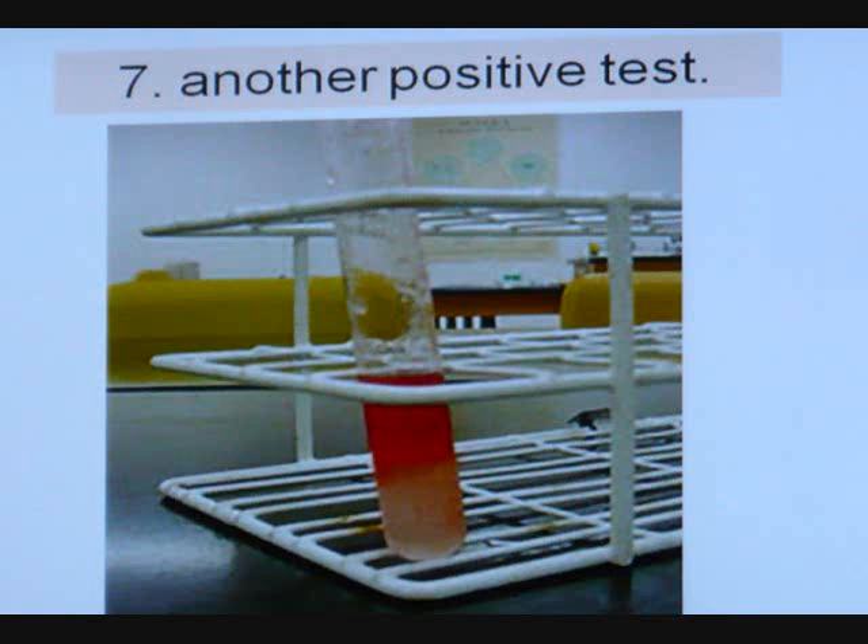I'm going to add the Sudan solution to it. I wonder how much of that will then turn red. I don't expect all of it to — I don't think it's all fat. But the more that turns red, the more fat is in there. I don't know whether the red layer is going to be on top or between the water and the fat — it might be yellow, red, and clear, like Benedict's test shows weakest to strongest.